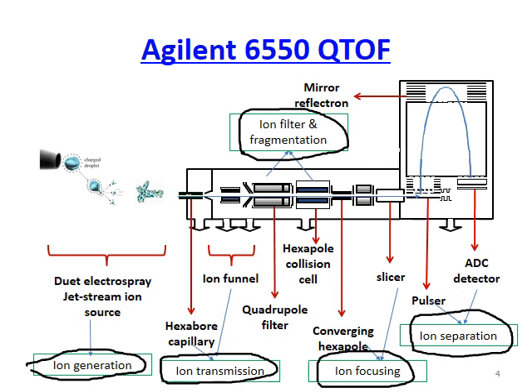After the ion source, ions will be sent to ion transmission, and there are 2 parts that are meant to transmit the ions: the hexabore capillary and the ion funnel.